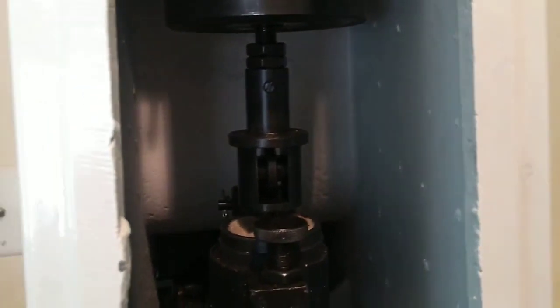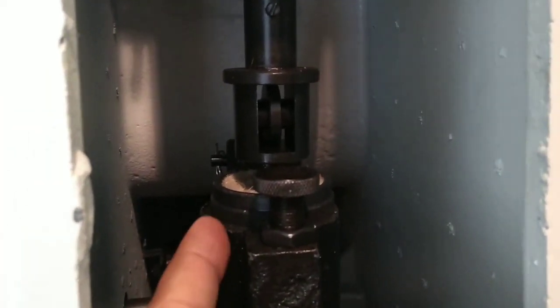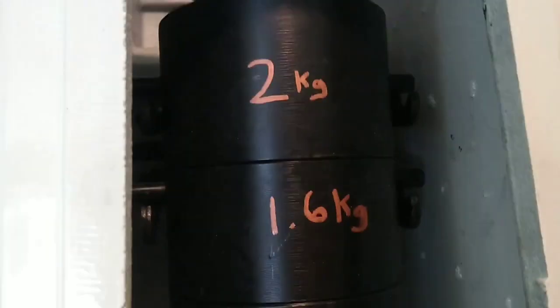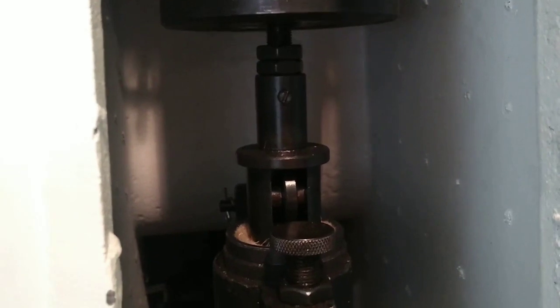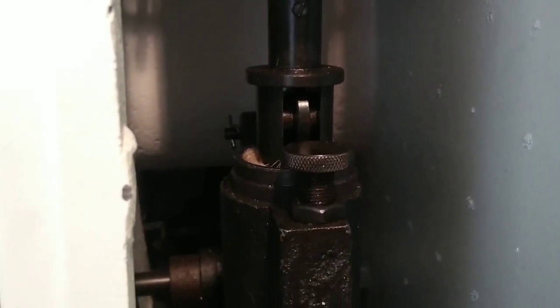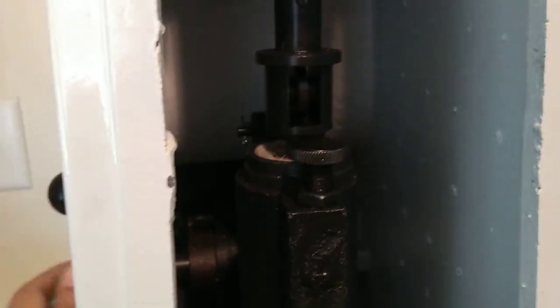We've got a lot of complex stuff back here, but it's pretty simple. This right here is a piston — they also call it a dash pot. It's filled with oil and it works like a dampener. So the idea is that when we load the machine, it slows down that weight stack from being transmitted to that diamond indenter, so that you don't worry about damaging or breaking that very hard and brittle diamond penetrator. Once it's loaded, you then release it, and that's when you get your reading.